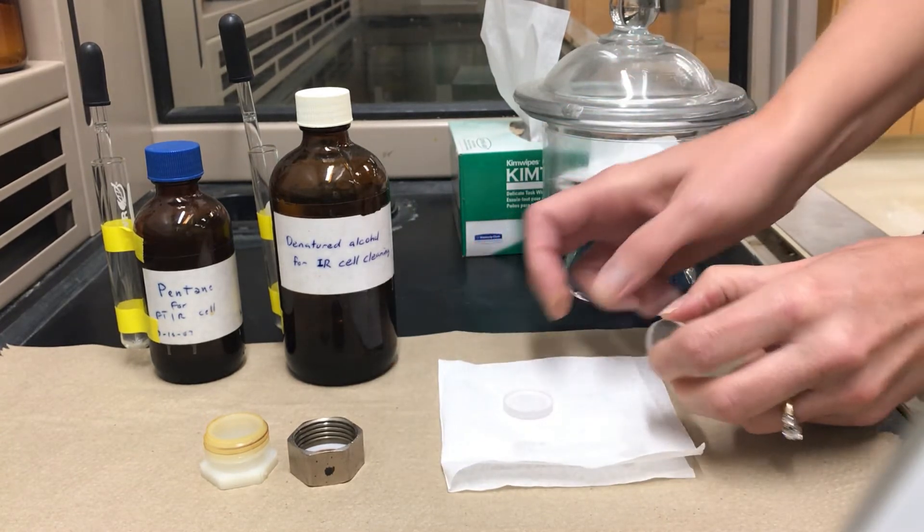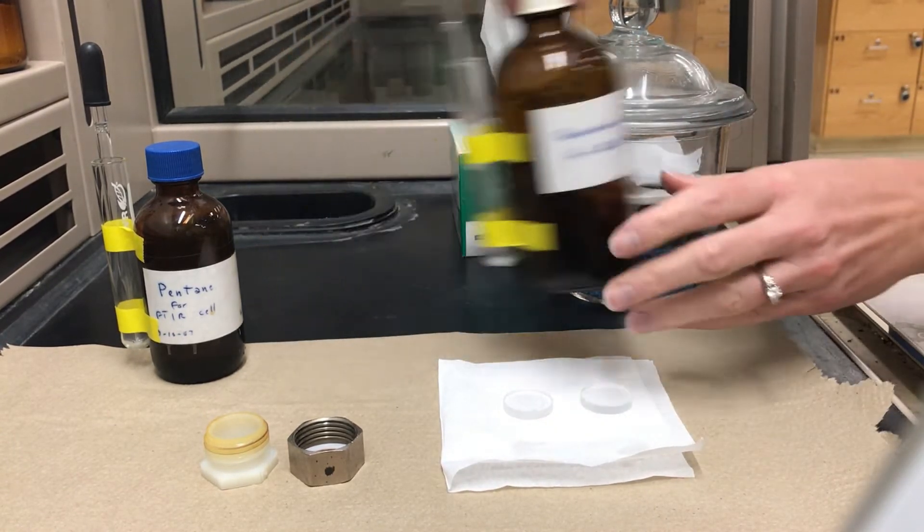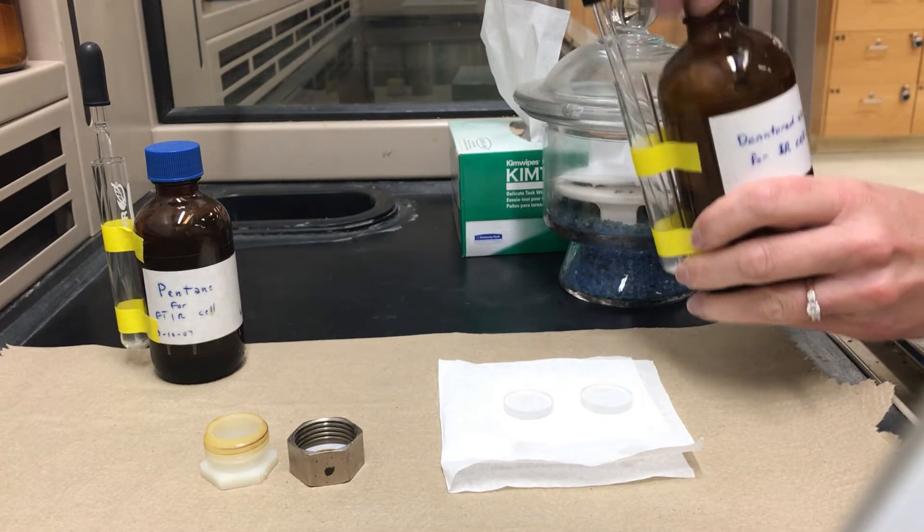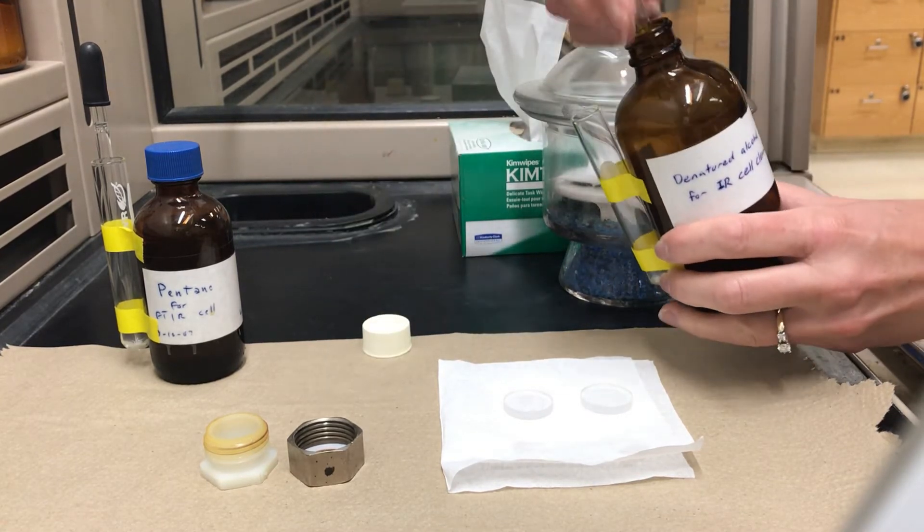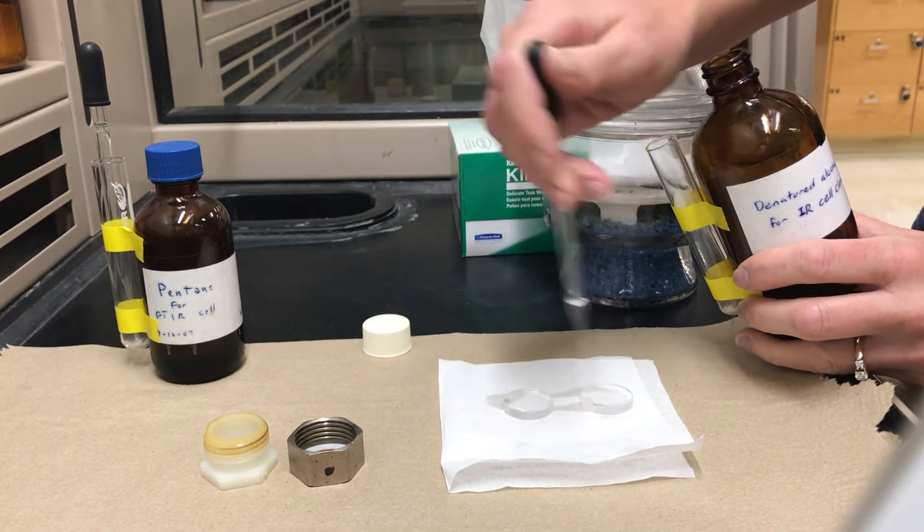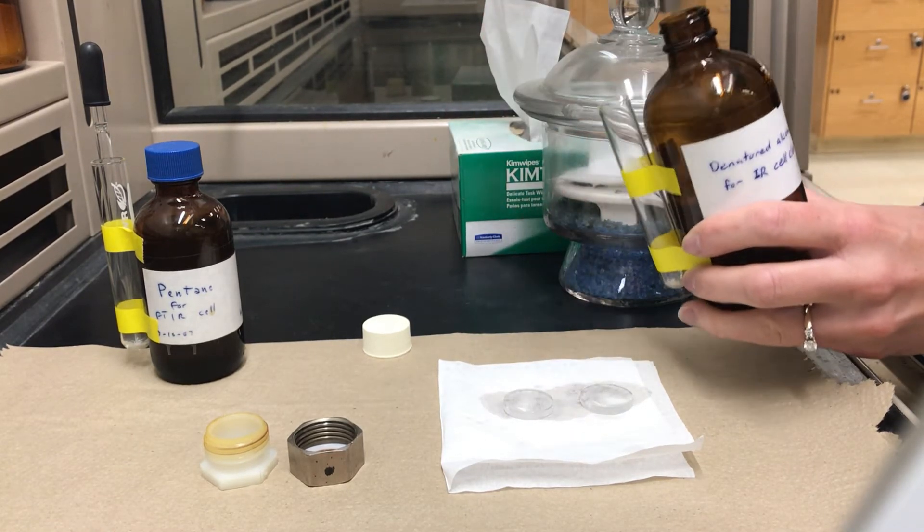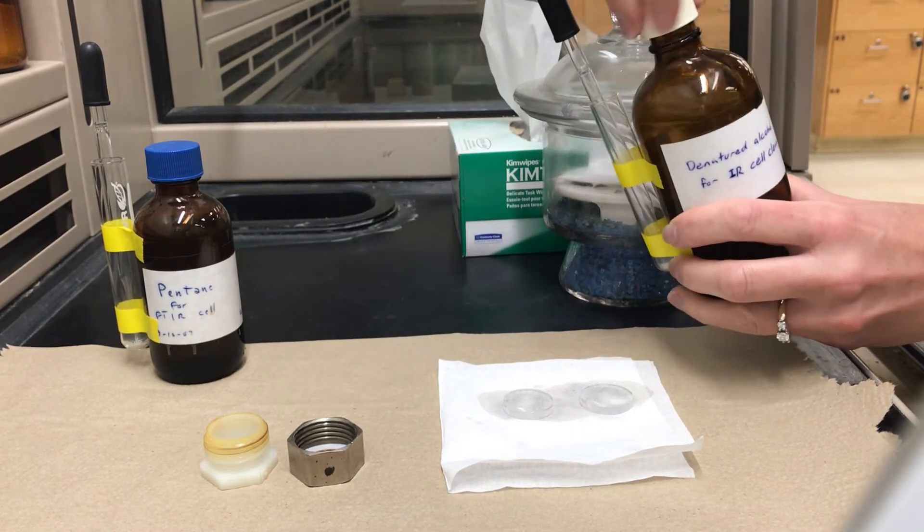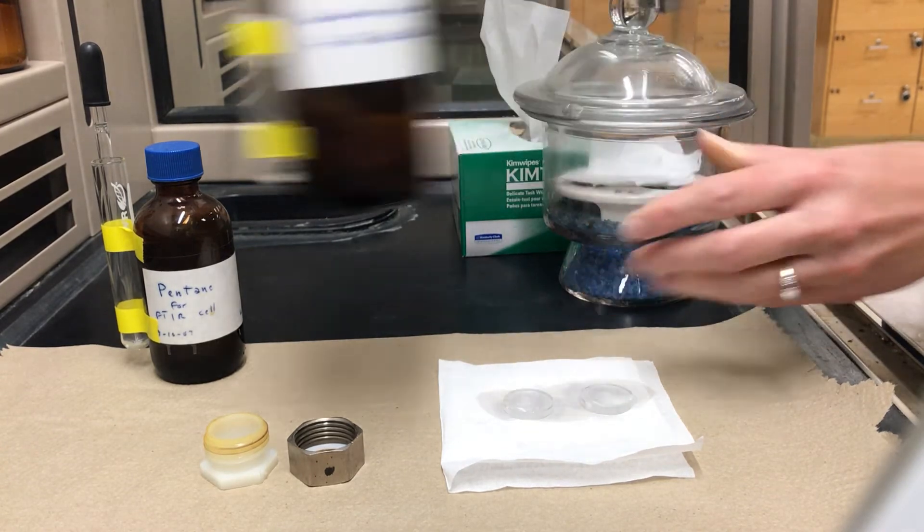That'll get the majority of the junk off. Then turn them upside down with the dirty sides up and we'll squirt a bunch of solvent on them to try to rinse off any residue. I'm first going to use some alcohol, some ethanol and that's good it dissolves a lot of things especially polar things.